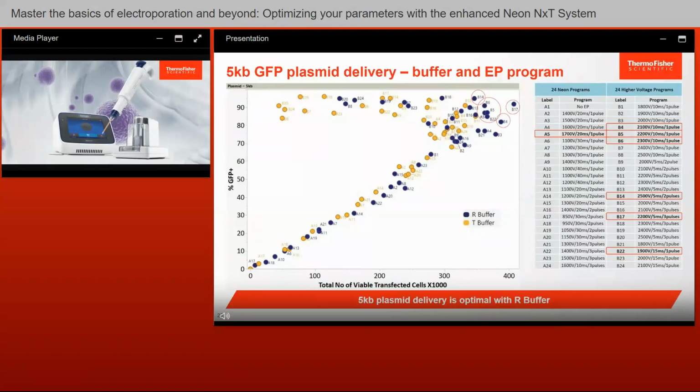Navy blue data points represent the results obtained with R buffer, while yellow data points represent the results obtained with T buffer. Each data point in this graph represents a specific electroporation program. A total of 48 different electroporation programs were used in this study.